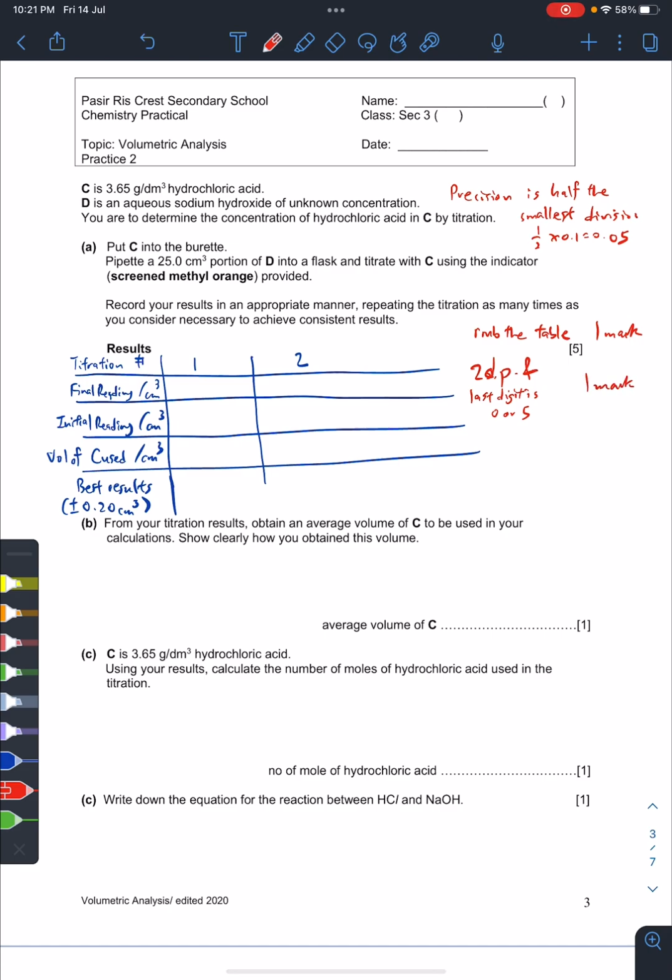That means you record your reading, everything, make sure there's 2dp. You make sure that happens, you get 0.5% of your O-level grade. So you memorize the table, you memorize the 2dp, 1%. Wow, you are 69% more to A. Okay, what else? So you see, it's 5 marks. It is legit 5 marks. So these 2 marks so far, no technique one. Isn't it just procedural, memorize only one? Got technique meh? No technique.